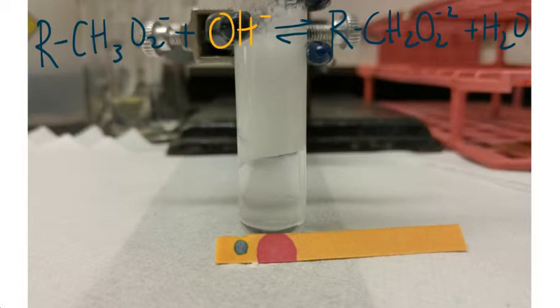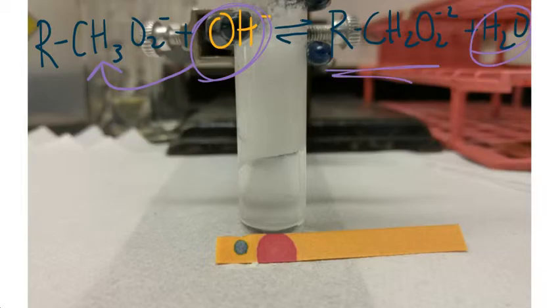To determine whether or not there's an acid, we add a base to the solution. That base will take the extra hydrogen from the acid, because an acid is a proton donor. It will form water and an ion. Again, ions are soluble, therefore it will form a solution, and that will be separate from the ether.